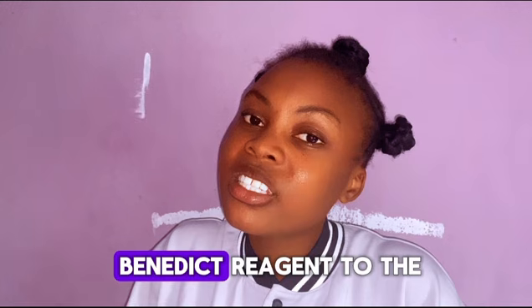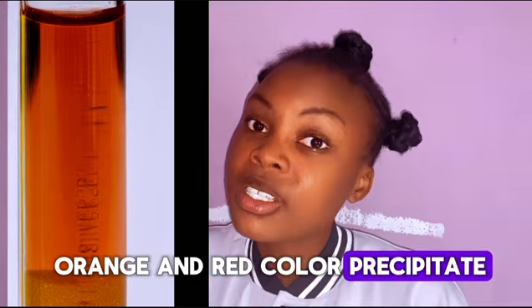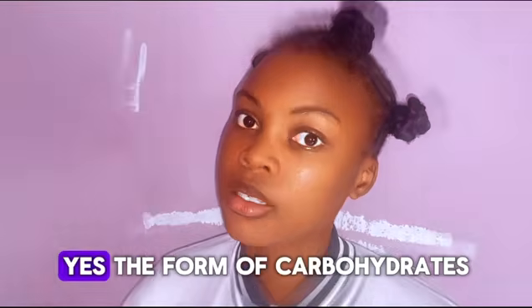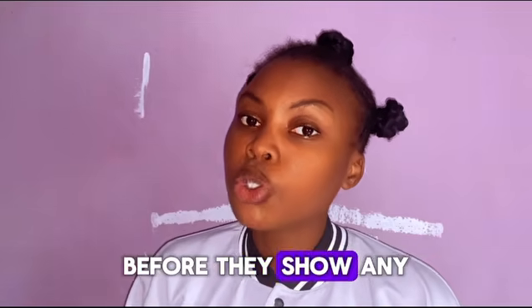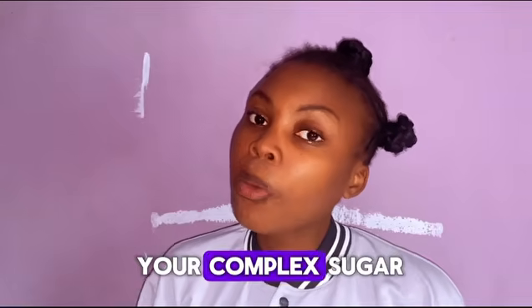The formation of an orange-red color precipitate confirms the presence of carbohydrates. The forms of carbohydrate which must first be hydrolyzed before they show any effect on Fehling's or Benedict's reagents are your complex sugars.